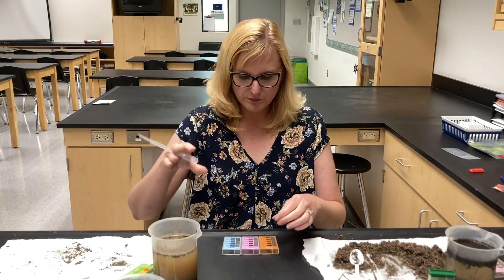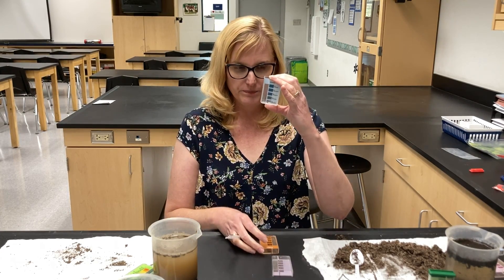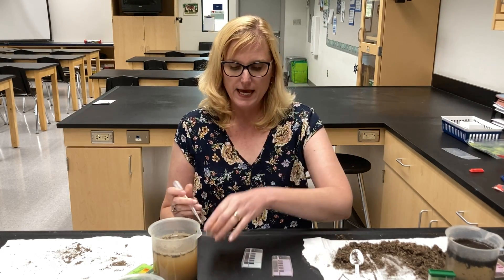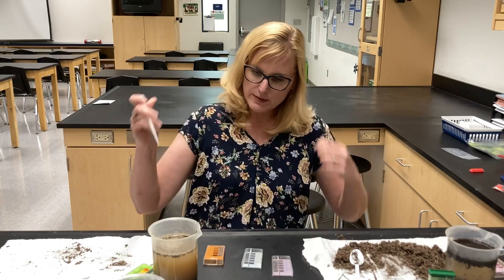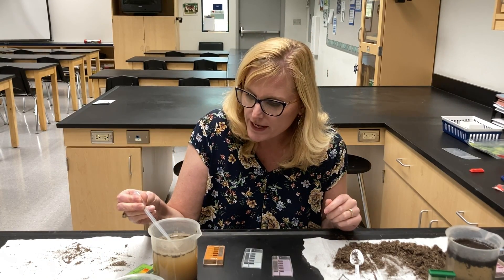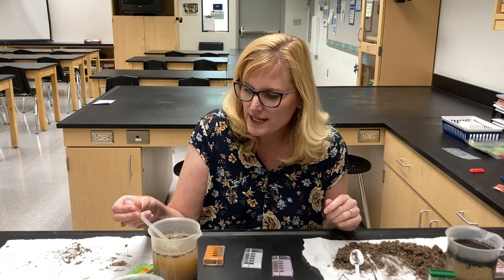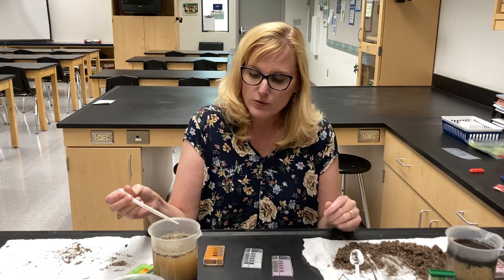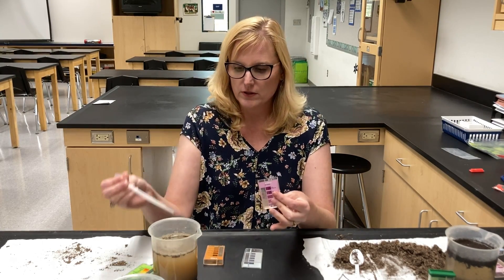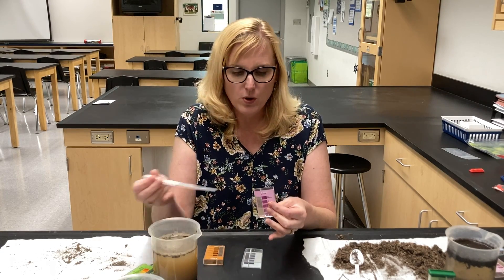So I have my nitrogen test, my potassium — phosphorus is P, and potassium is K. I'm going to get the very lightest color here without any chunks of soil. What we're measuring is the ions that have come out of the soil into the water. And I fill up my chamber with our soil sample water.